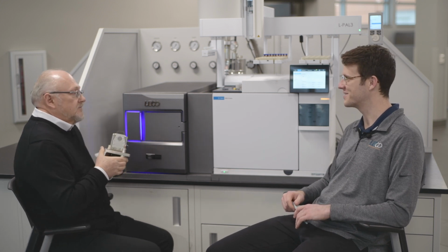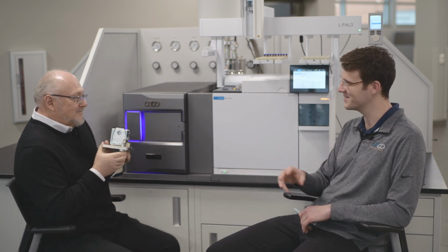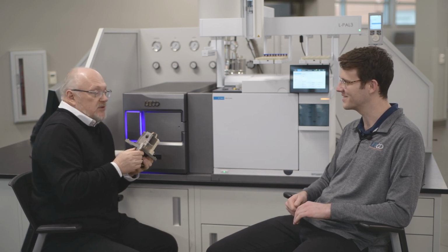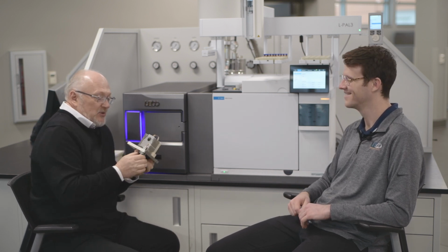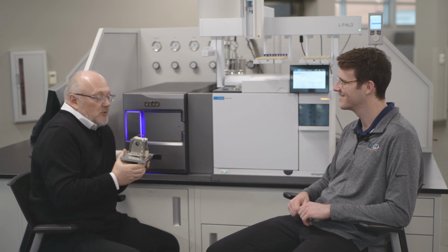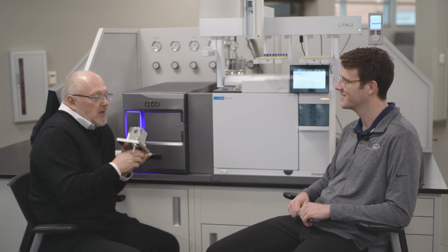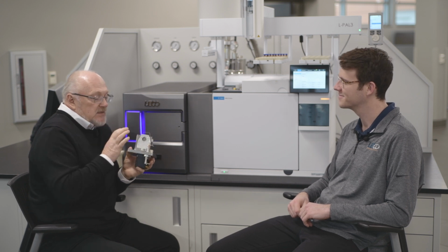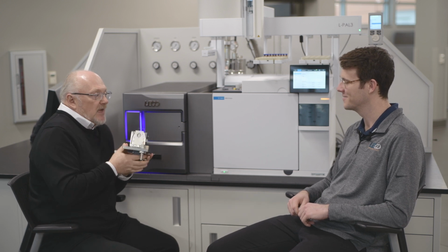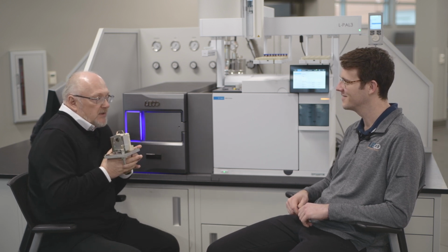That's pretty science fiction, going from ions to electrons to light, back to electrons to signal. Yeah, life is not simple with time-of-flight mass spectrometry in particular. And this is what it takes to achieve those great performance, reliability, robustness, and also the time performance which is required for time-of-flight.